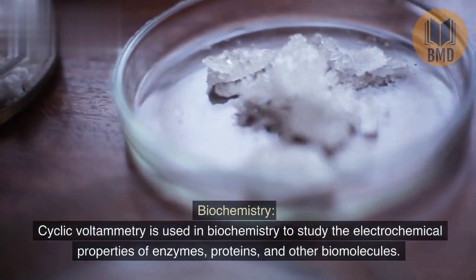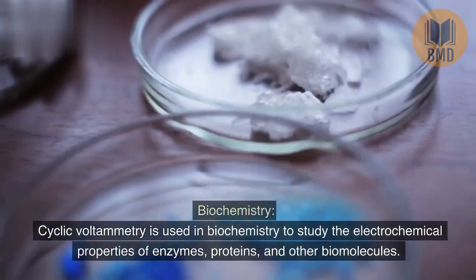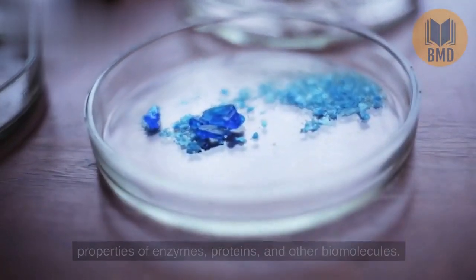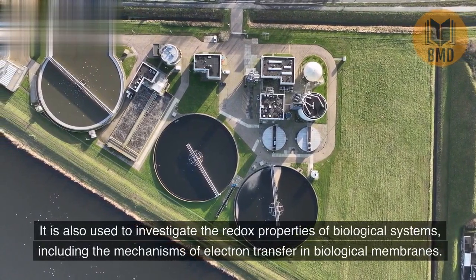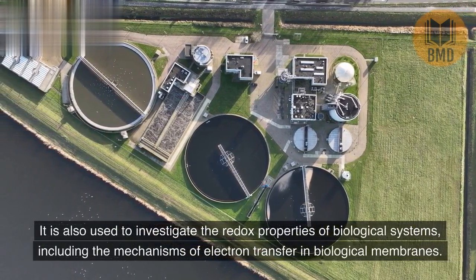Biochemistry. Cyclic voltammetry is used in biochemistry to study the electrochemical properties of enzymes, proteins, and other biomolecules. It is also used to investigate the redox properties of biological systems, including the mechanisms of electron transfer in biological membranes.